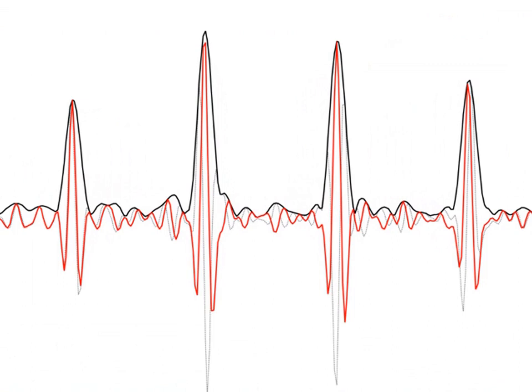One great feature of the absorption mode are the negative side lobes on either side of the peaks in the spectrum. Now I know many people are not used to seeing these, but they do contain a lot of great information. Firstly, they are sometimes the easiest way to quickly recognize if the spectrum is well phase corrected. You should be looking to see if the side lobes are nice and symmetrical across your spectrum. If they are not, then that might indicate a phase correction problem.